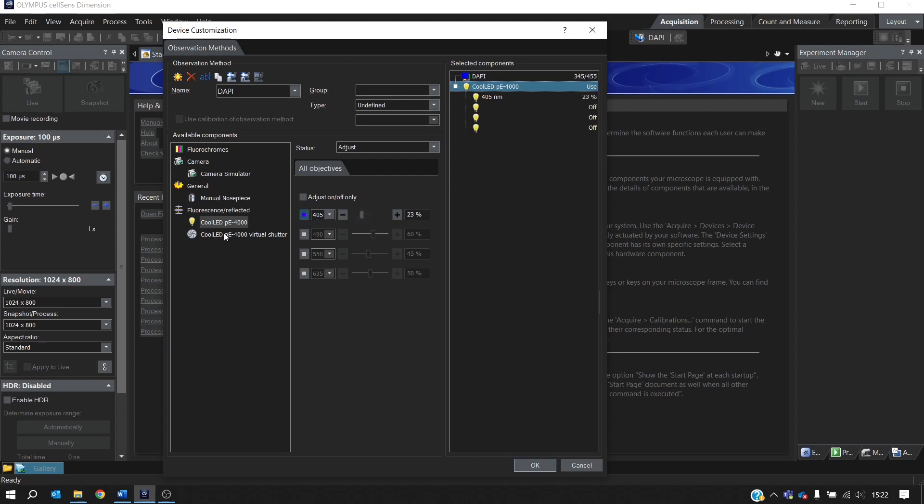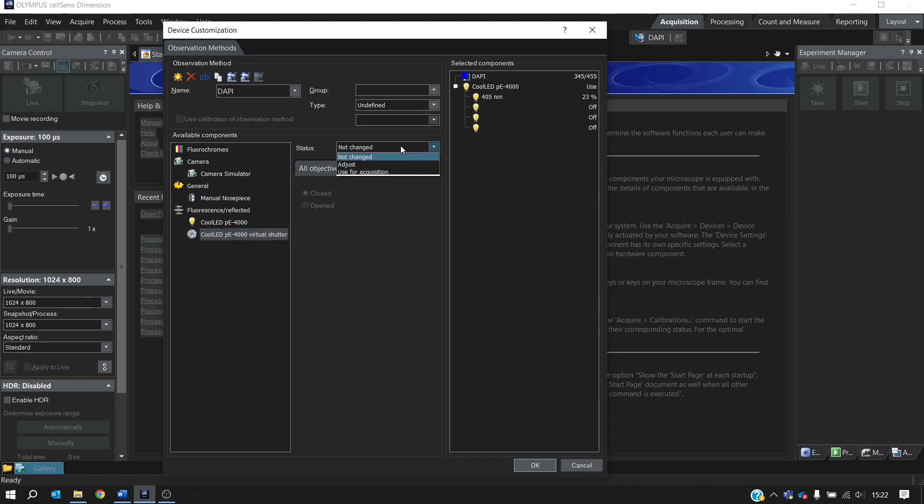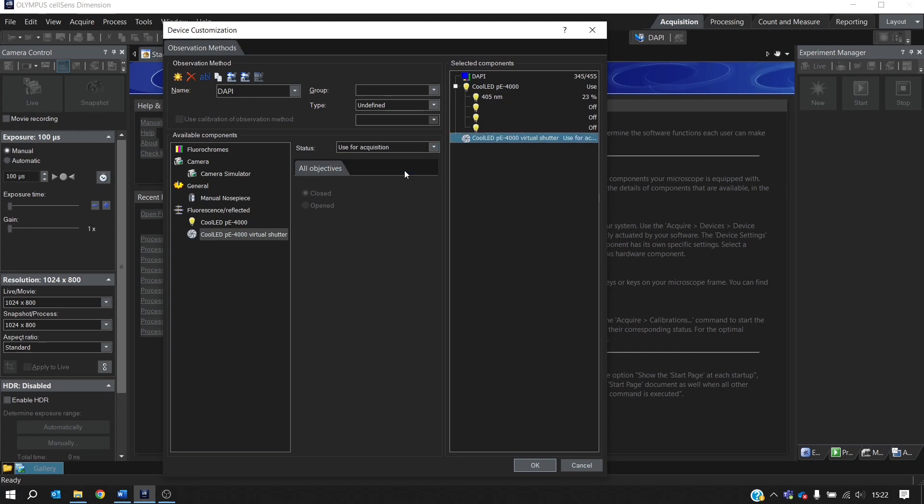Next, we want to set the virtual shutter. And here we change the status from Not Changed to Use for Acquisition. And this is a really useful setting because it means the LED is only on when the camera is acquiring an image, so you're reducing the amount of light your sample is exposed to and therefore you're reducing the risk of photo damage. So we'll select this, and that's the first observation method set up.